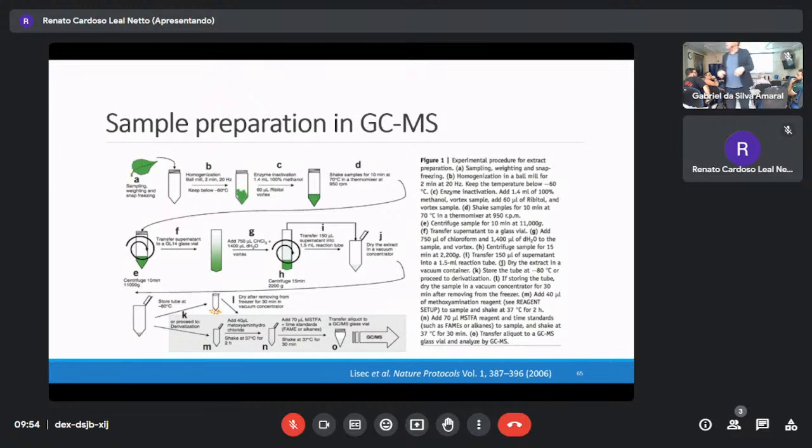You should be very careful with wild samples. I don't have any solution, but to solve this one, you have to collect a larger number of samples. There is only one solution.